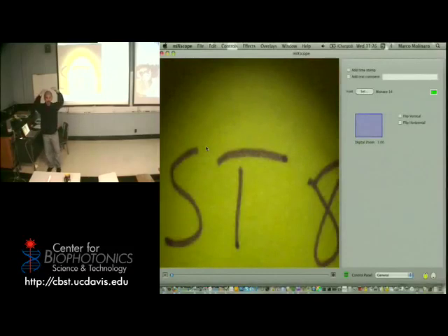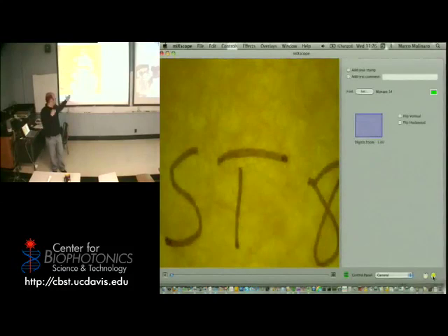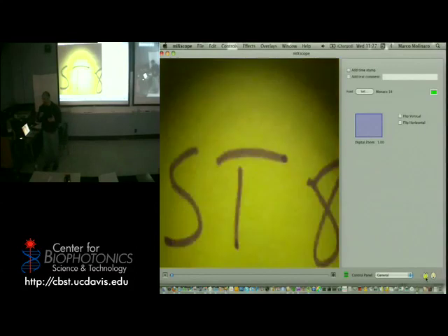this is from light coming from the top. So this is what's called reflection microscopy. I'm shining light on the subject, light's bouncing back through, and I see it. I can also shine light from below, or transmission. This is the most common type of microscopy that you're used to, where you shine light through the sample to see what's going on. And what you'll notice is that it tends to emphasize slightly different things. Things look a little bit different, whether you light them from the top or you light them through. So those are 2 different types of microscopy.